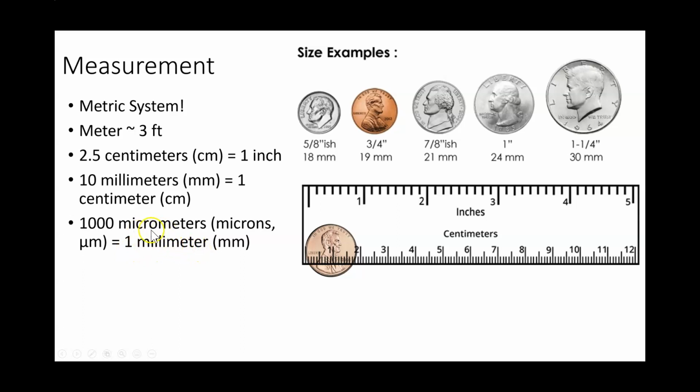A common term for a micrometer, some people call it a micron. It's just easier to say. It's less syllables, I guess. So if you're watching a video or reading about this, you might hear it referred to as a micron.